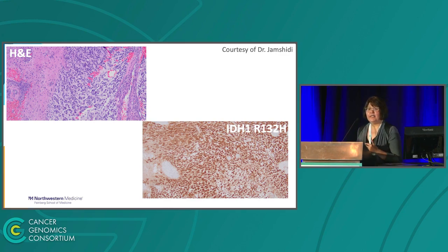And if you compare it with our copy number assessment from methylation data, the ploidy was completely missed. And that's again due to lack of SNP information in our analysis.